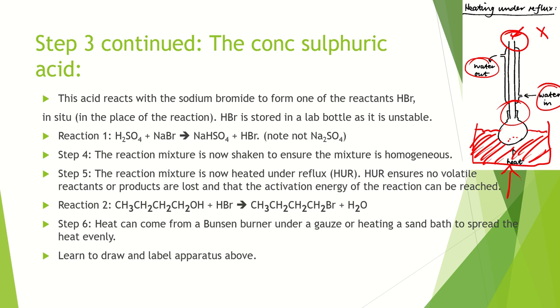Right, when I get my HBr made, then my reaction with the alcohol here can start to take place, and I'm going to make my product, my bromobutane as it is in this particular instance. And remember, I made a byproduct here also of water. Remember, I'm going to have to get rid of that later on. As I said earlier, whenever we are doing a preparation, we're making a substance in its pure dry state.